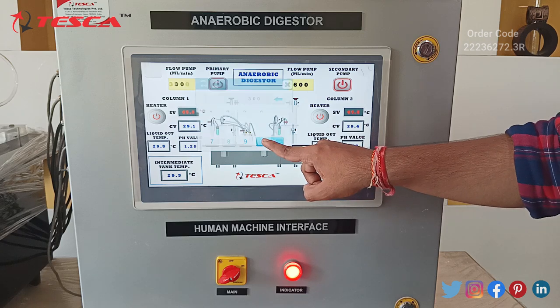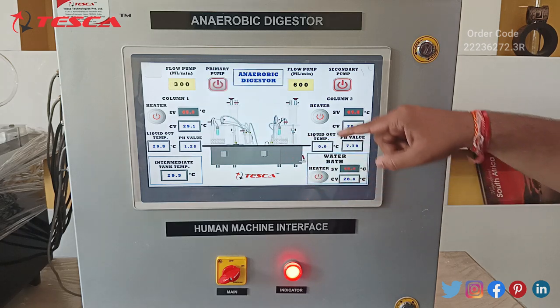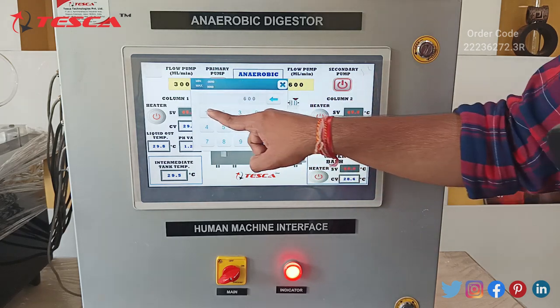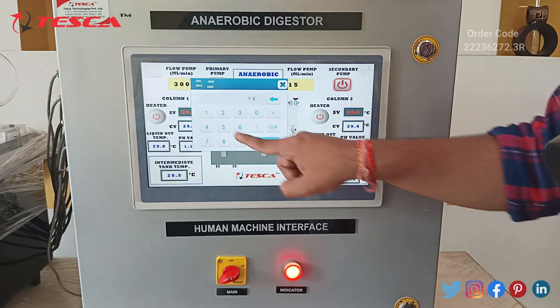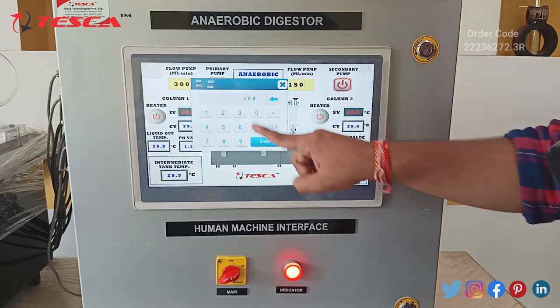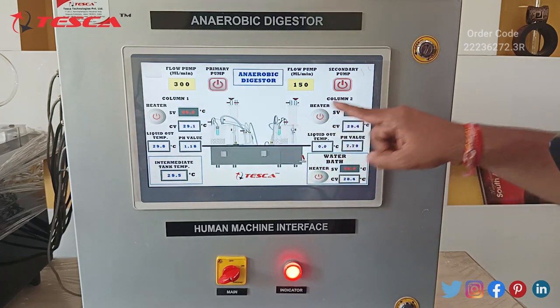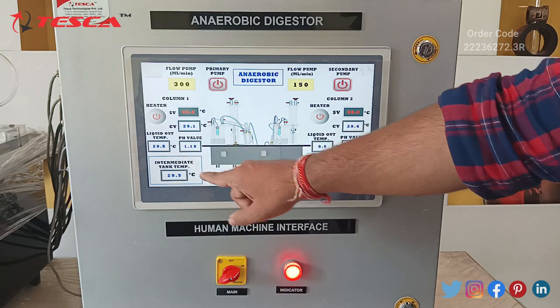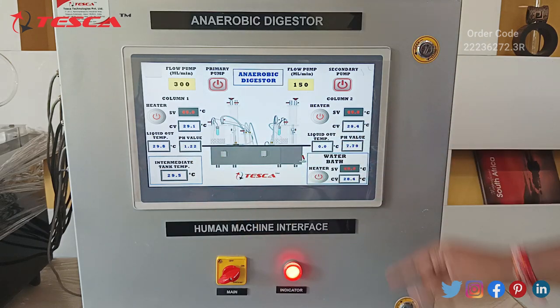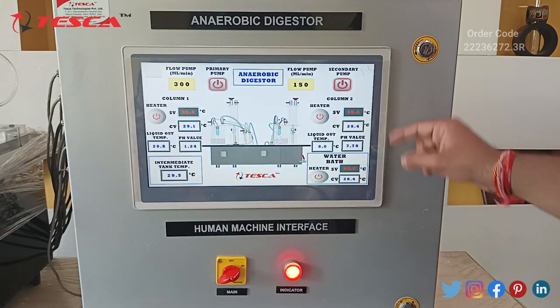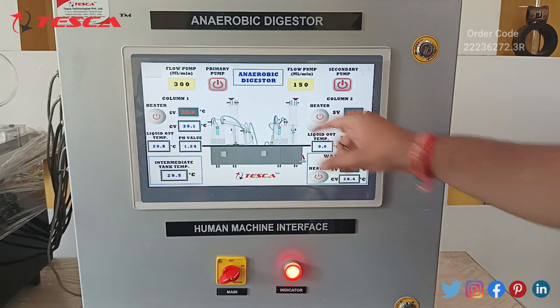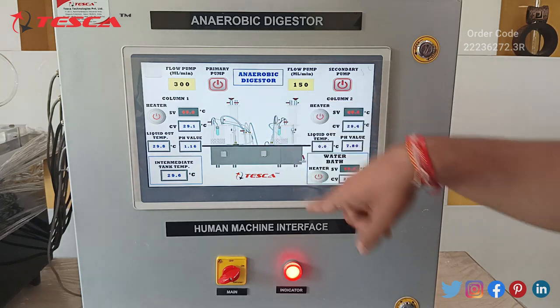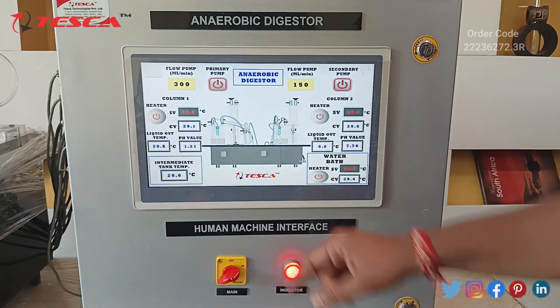We can enter the primary pump flow rate as 300 and for our secondary pump we can set it to 150. This control unit is for column 1 and this control unit is for column 2. Here we have our diagram and image of our working unit.